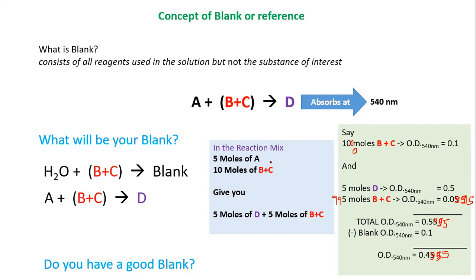So I hope from this point onwards, when you perform the practicals, whenever the colleges reopen and you can perform the physical practicals all by yourselves, you would be able to figure out why you're using a blank and why you're preparing the standards. I hope that I have made the point pretty clear to all of you, right? Was it not interesting to find out how we actually prepare the blank?